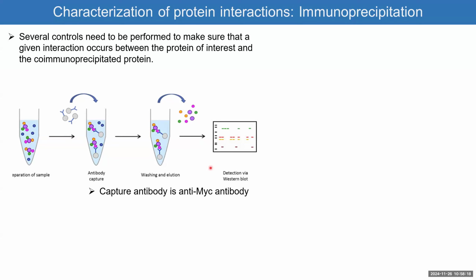One more time. And there's a question, and then there's a specific example for you here. So again, you have many proteins. Some of them are in complexes together, and some are not. The protein in blue here is alone, whereas the proteins in yellow, green, and violet color are in complex.